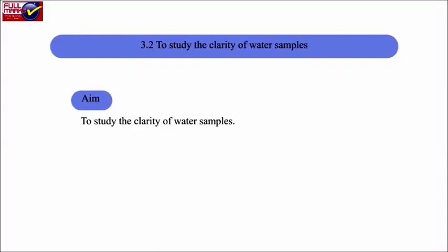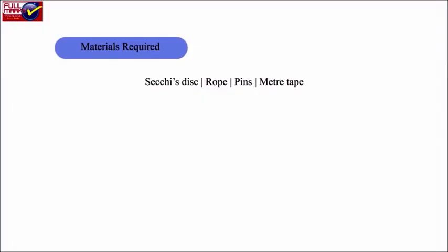To study the clarity of water samples. Aim: to study the clarity of water samples. Materials required: Secchi disc, rope, pins, meter tape.